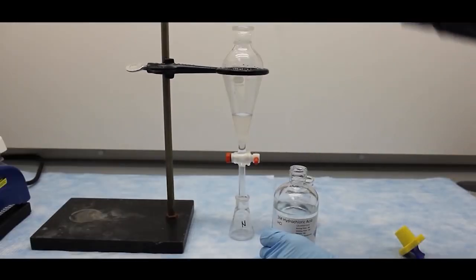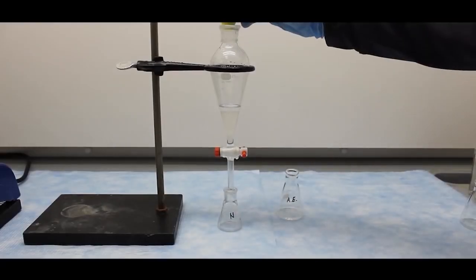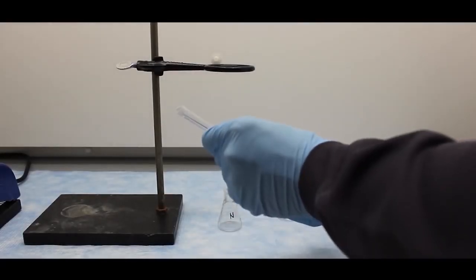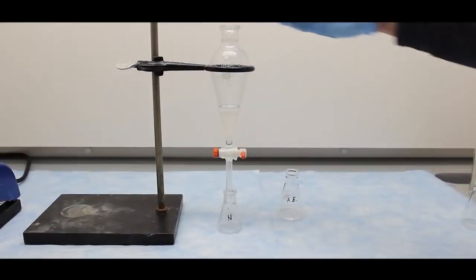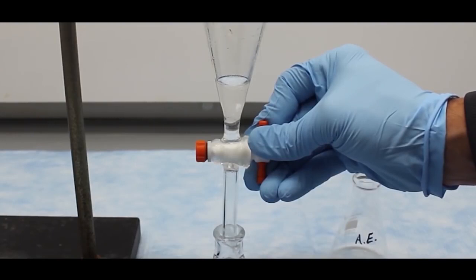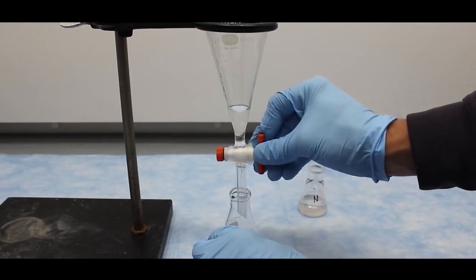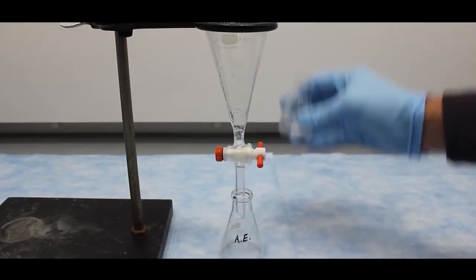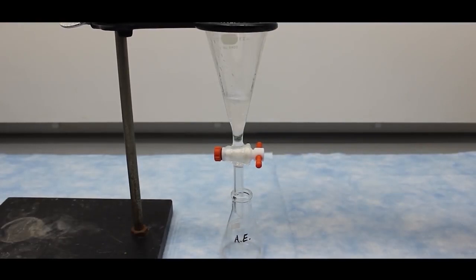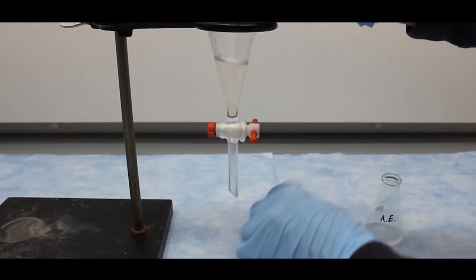I will add approximately another 5 milliliters of 3 molar HCl. Cap the sep funnel, shake it, vent it, shake it, vent it. Drain off the bottom neutral DCM layer, and then collect the top aqueous acidic extract layer. I will pour back the neutral layer that should no longer contain p-bromoaniline, but still contains benzoic acid and phenanthrene.